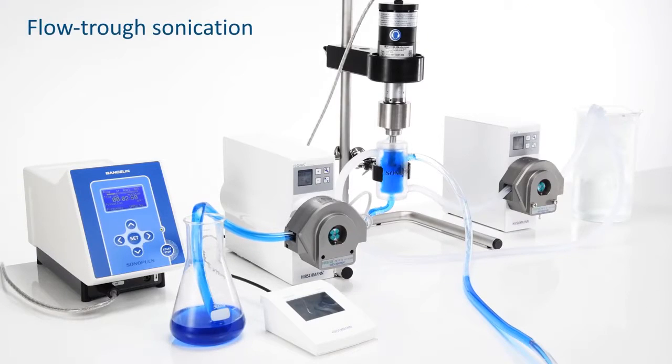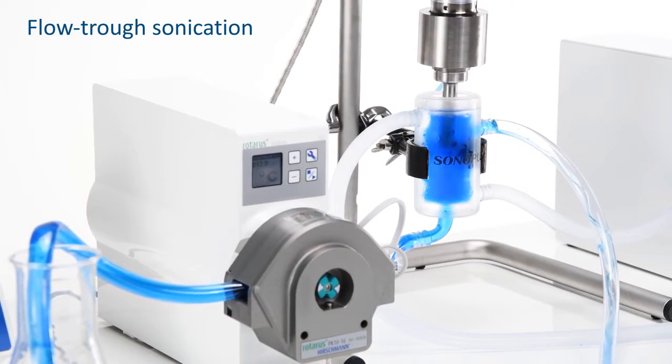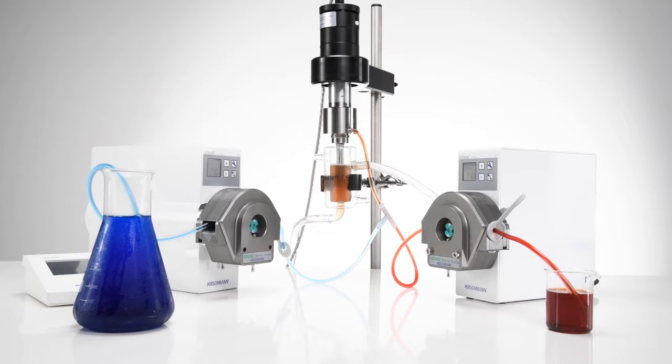Our products provide continuous sonication in continuous flow processes to fulfill the highest laboratory and production standards. You can use the flow-through booster horn to mix two substances, such as oil and water, in keeping with predefined specifications.